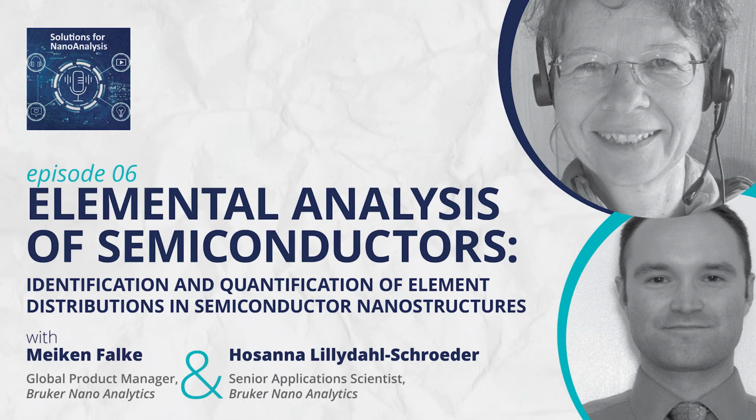And when we talk about TEM, we need to relate EDS to EELS. That is important. So EDS is energy dispersive X-ray spectroscopy. Some people like to call it EDXS because it has 4 letters like EELS.